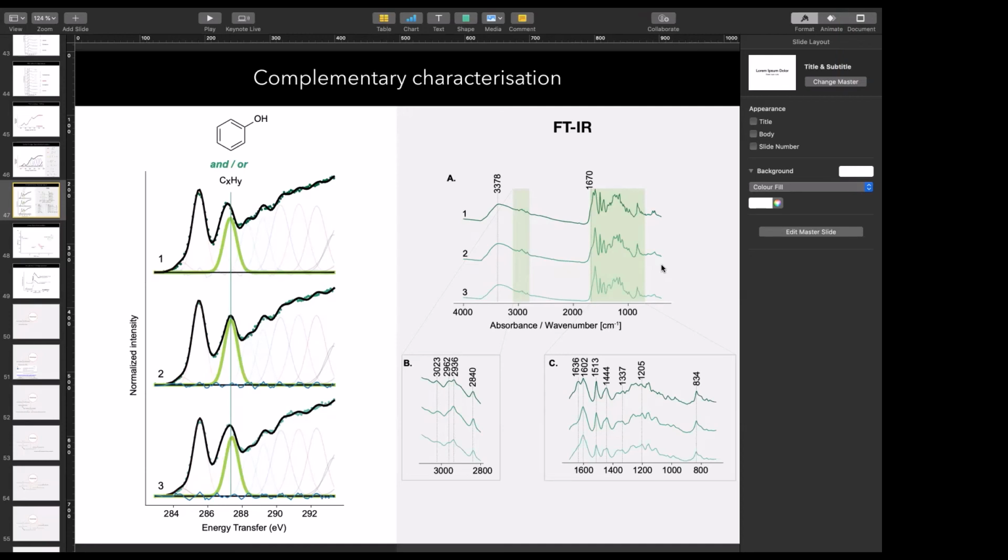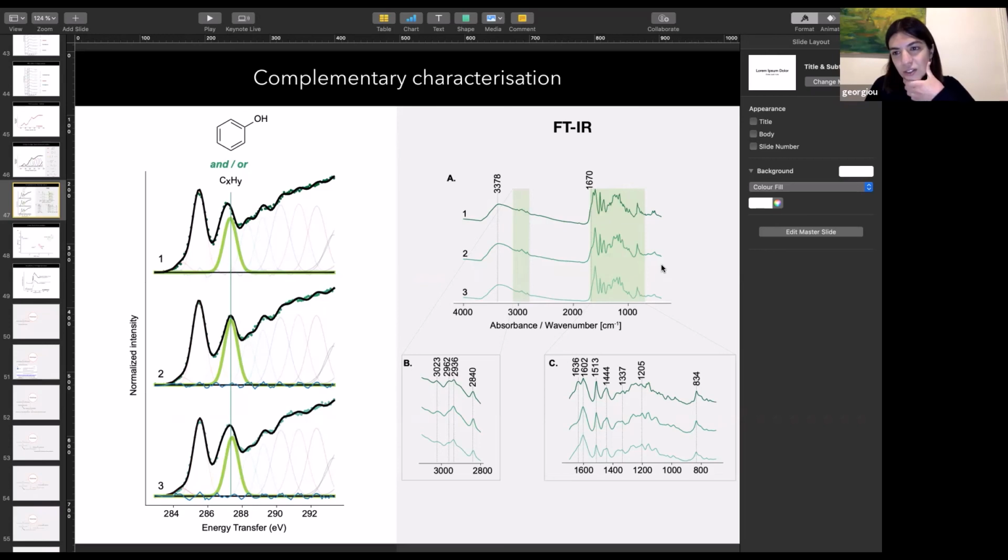With these techniques, another question: what is the detection limit, for example, of carbon in these samples? Excuse me, I didn't understand the question. What kind of concentration, what percentage of carbon needs to be in the sample to be able to detect it? I cannot be quantitative. I didn't do that. I wish I could answer this question, simplify also my life, but I couldn't. I think more research should be done to be able to give you quantitative numbers. Thank you. It's going to be very case specific and spectrometer specific, yeah.